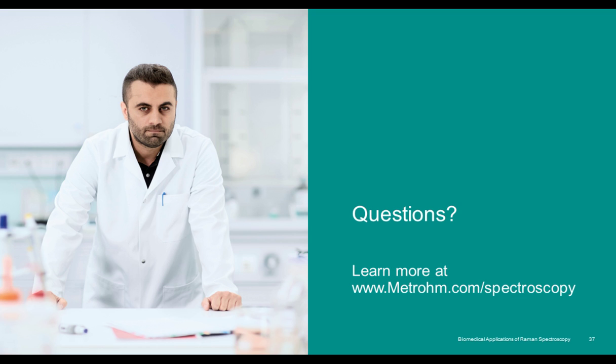And so this is usually done building some sort of chemometric model for quantitative analysis, where you have some known concentrations to build your standards off of, and then with the Raman measurement, you can do it just directly in the vessel, so you don't have to sample from the vessel itself, and then also that's a non-destructive measurement, so you're not altering the actual sample itself.